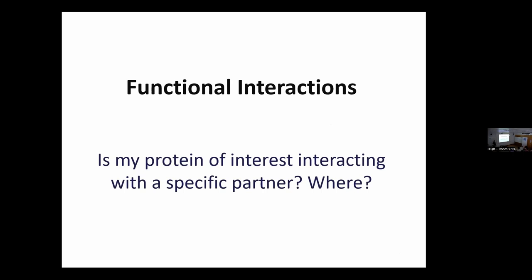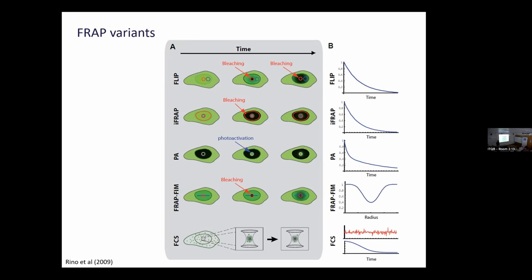All right, so let's leave dynamics a little. I don't know if you have any questions. Yes. Can you use FRAP to complement information? You're talking about identifying maybe complexes of proteins from mass spectrometry. Isn't it mass spectrometry? Yes.